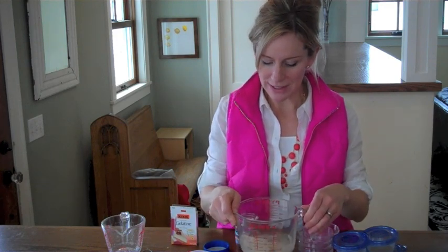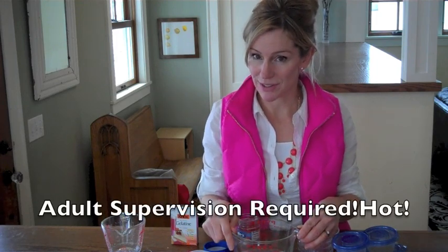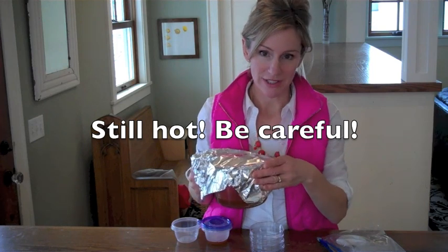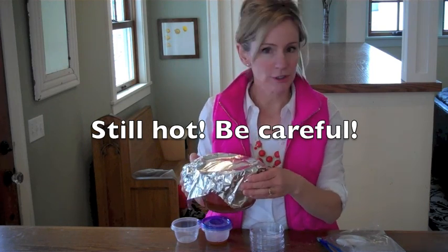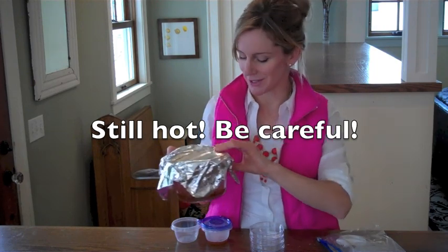I'm going to take this mixture of microbe food over to the microwave and alternately cook it and stir it. Make sure an adult supervises this part because the agar-agar gets very hot. When your agar or gelatin has dissolved, cover it loosely with aluminum foil and let it cool for a few minutes. Then you can start pouring your plates.